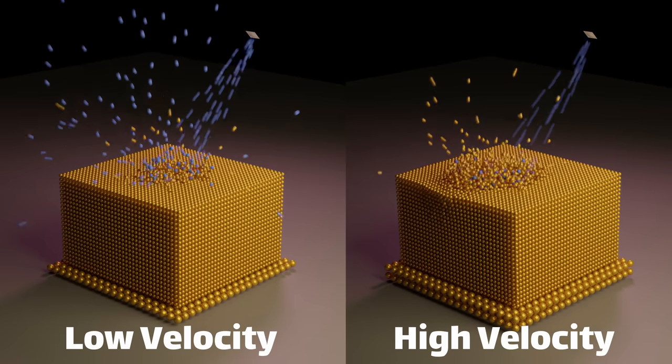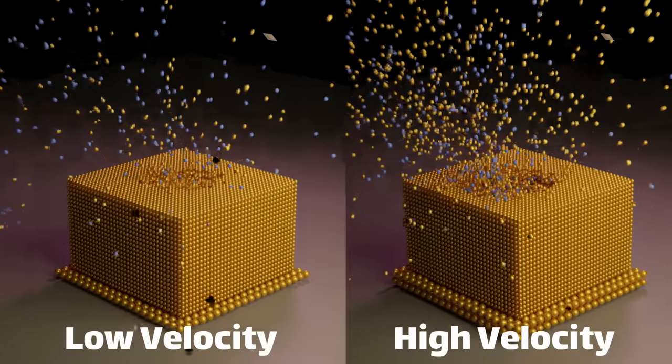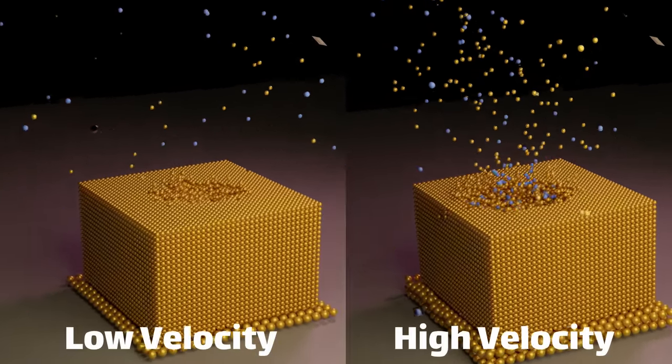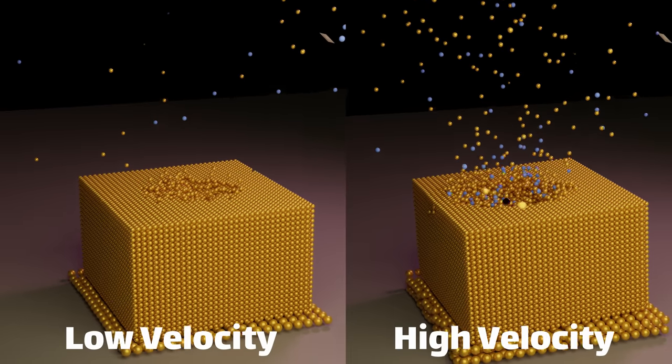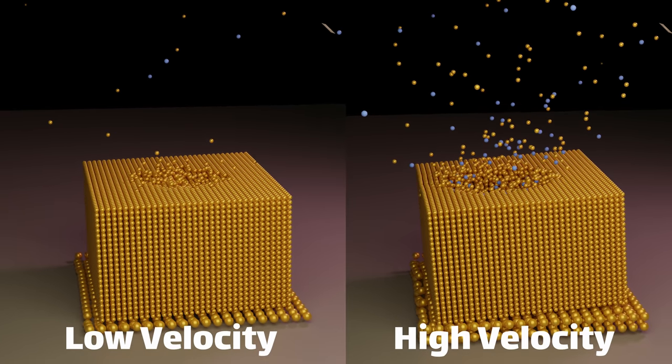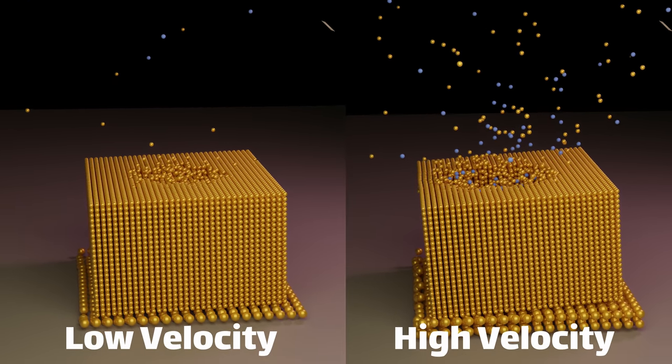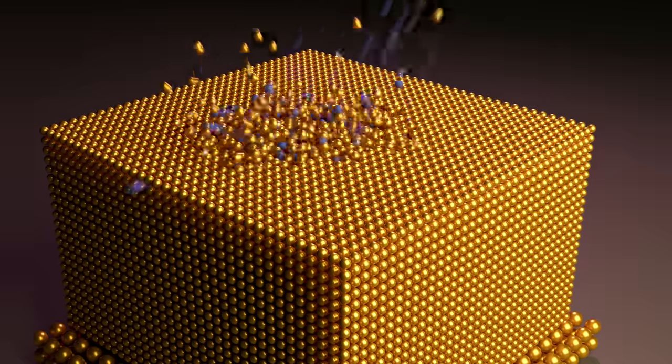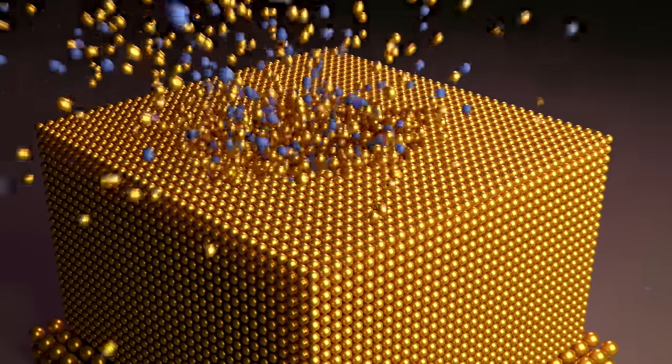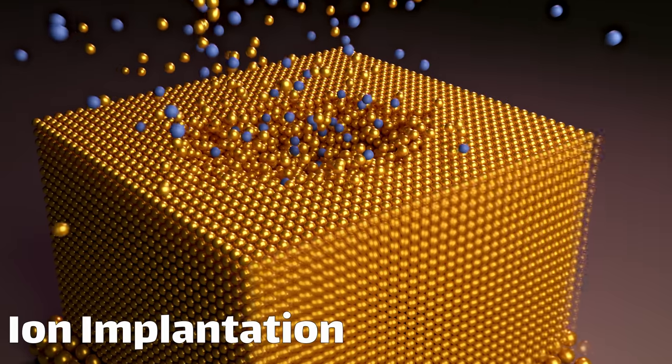If we change how fast the argon is being accelerated, we can change the depth and size of the crater. Because more speed of the particles means more kinetic energy, which is transferred into the sample. In all the simulations, you can see argon being embedded into the sample. This actually happens in real life, and it's one of the reasons argon is used as opposed to a different gas. The process is called implanting, and it's generally an unwanted side effect.